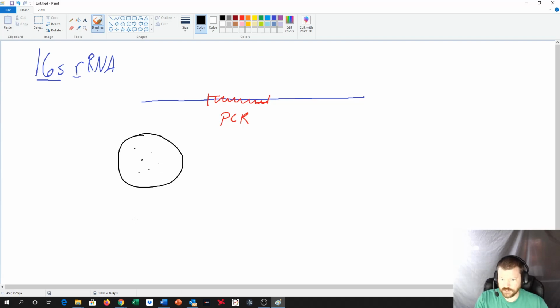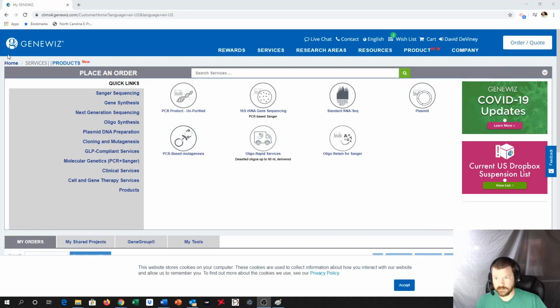And so, that's kind of what I want to show you today. I want to walk you through the process of how we were going to do that, right? And so, one of the things we were going to use is this company called Genewiz. They're the company that I would use to send samples off to actually have them sequenced. It can cost anywhere from $6 to $9, depending on what you want to have done. So for us, if we were going to do this in lab, it would probably cost about $9 a sample.